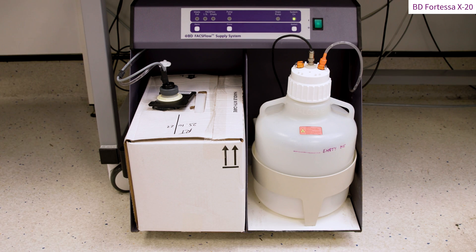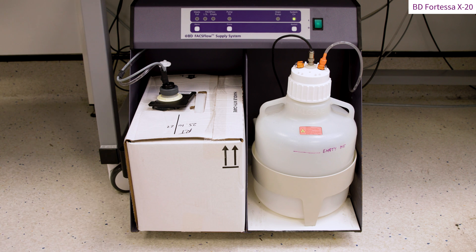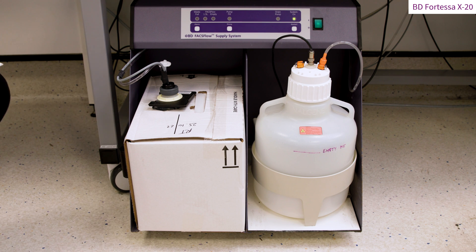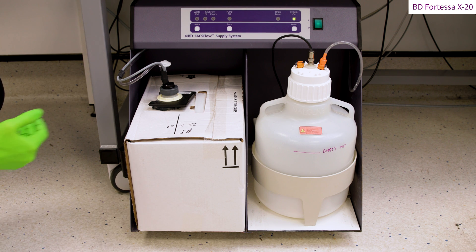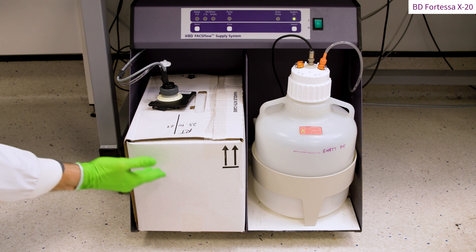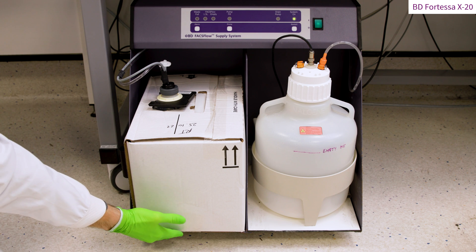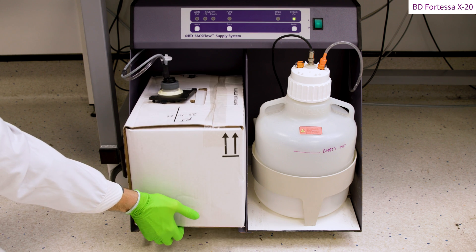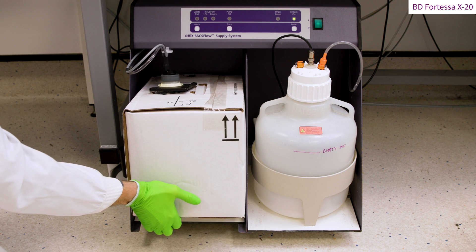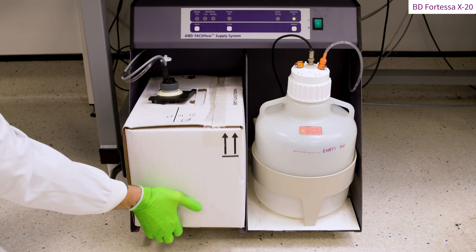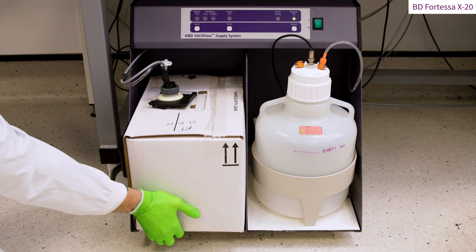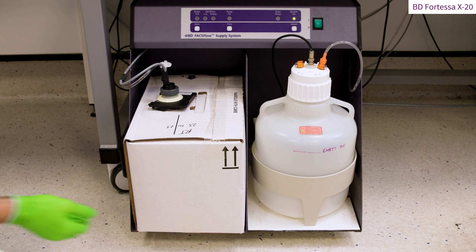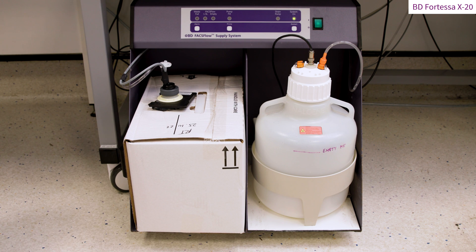The sheath fluid tank is located on the left-hand side of the fluidic cart. At the start of acquisition, it is important to check that this tank is sufficiently filled to support the length of your acquisition. This can be done by lifting the tank up in order to sense the weight of the sheath left in the tank.